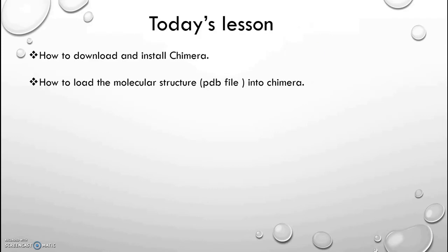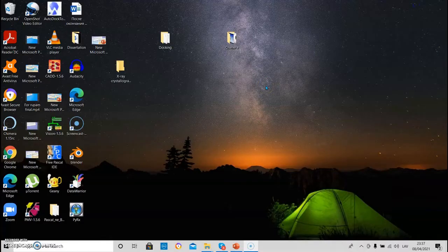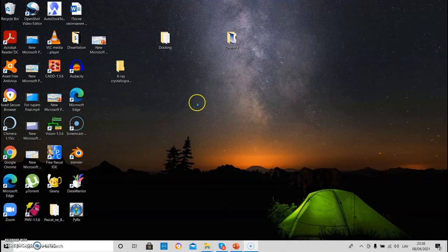Today's lesson: In today's lesson, we have to learn how to download and install Chimera, and also how to load the molecular structure in the format of PDB file into Chimera. Okay, let's go.